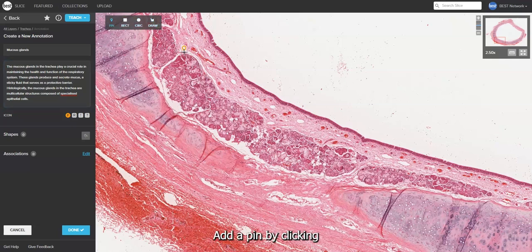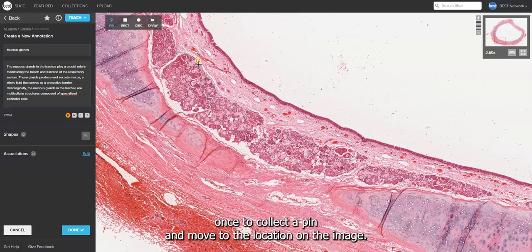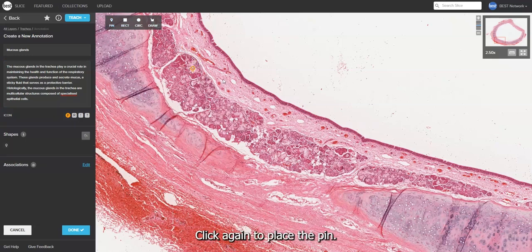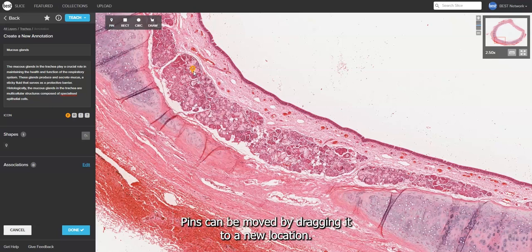Add a pin by clicking once to collect a pin and move to the location on the image, then click again to place the pin. Pins can be moved by dragging to a new location.